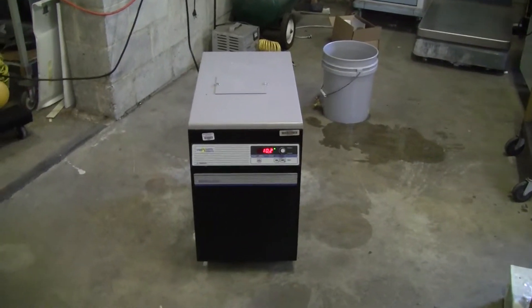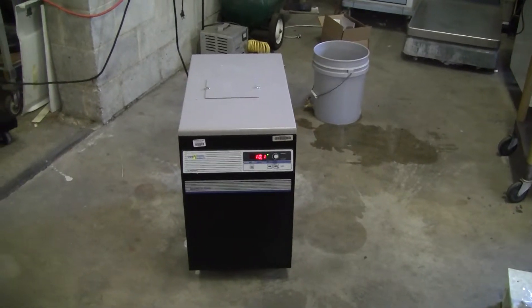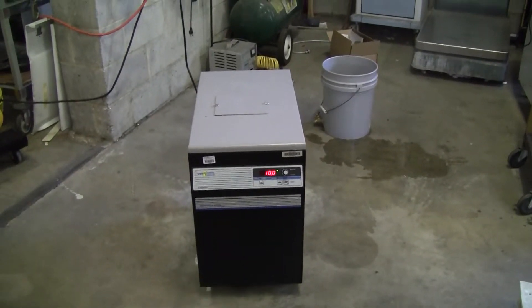Hi, this is Cody from Hi-Tech Trader. Today we're looking at a VWR recirculating chiller. The unit runs off at 230 volts, 60 hertz and 7 amps.